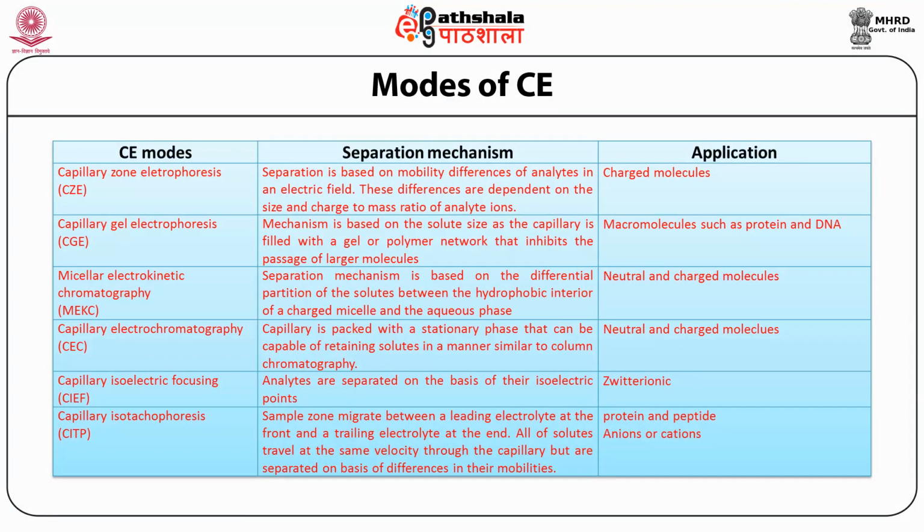Now let us talk about the modes of capillary electrophoresis. Different modes of capillary electrophoretic separations can be performed using a standard CE instrument. The origin of the different modes of separation may be attributed to the fact that capillary electrophoresis has developed from a combination of many electrophoresis and chromatographic techniques. In general terms, it can be considered as the electrophoretic separation of a number of substances inside a narrow tube. Most applications have been performed using liquid as the separation media.